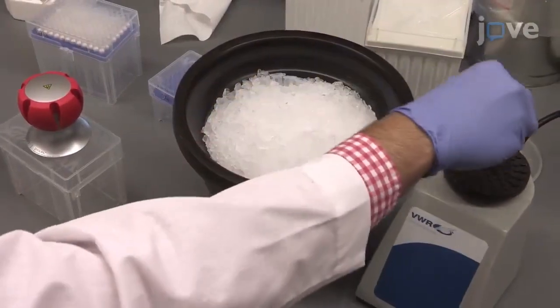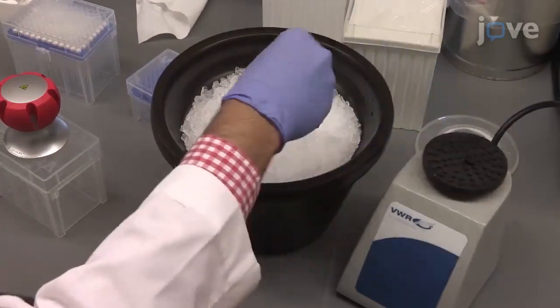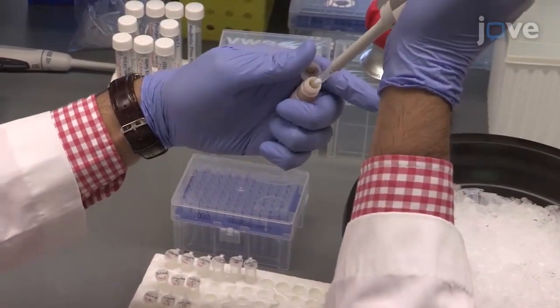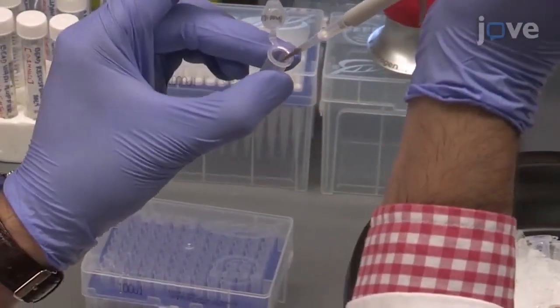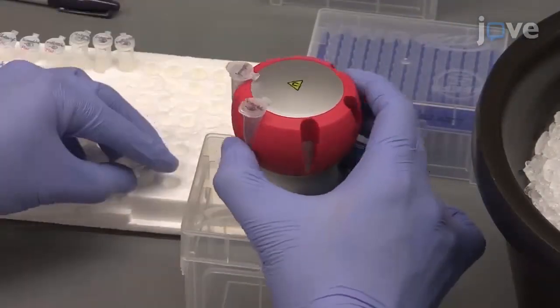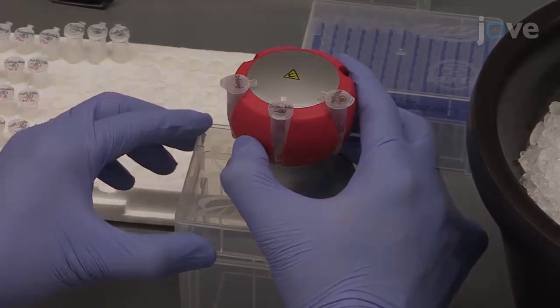To coat the magnetic beads with streptavidin, first vortex the beads thoroughly to re-suspend. Then, transfer 30 µL of the re-suspended beads in a 2 mL nuclease-free microfuge tube. Leave the tube filled with the magnetic bead suspension on the magnet for 2 minutes.